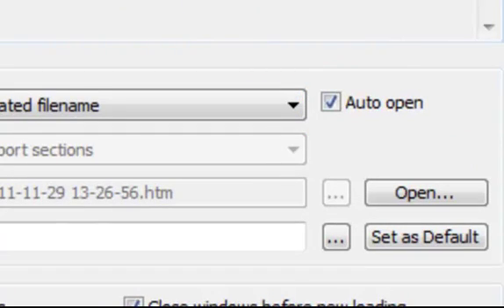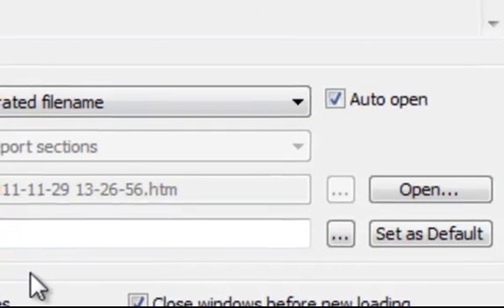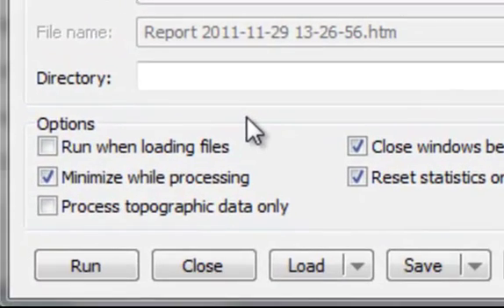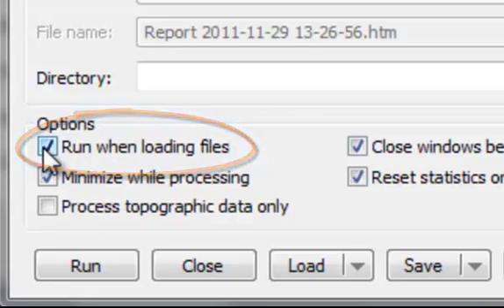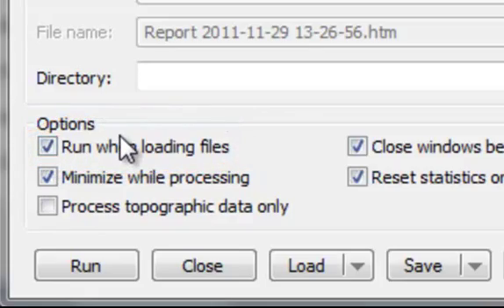Now, let's open some files to generate the report. We'll enable this option so that the report is generated when we load the files.